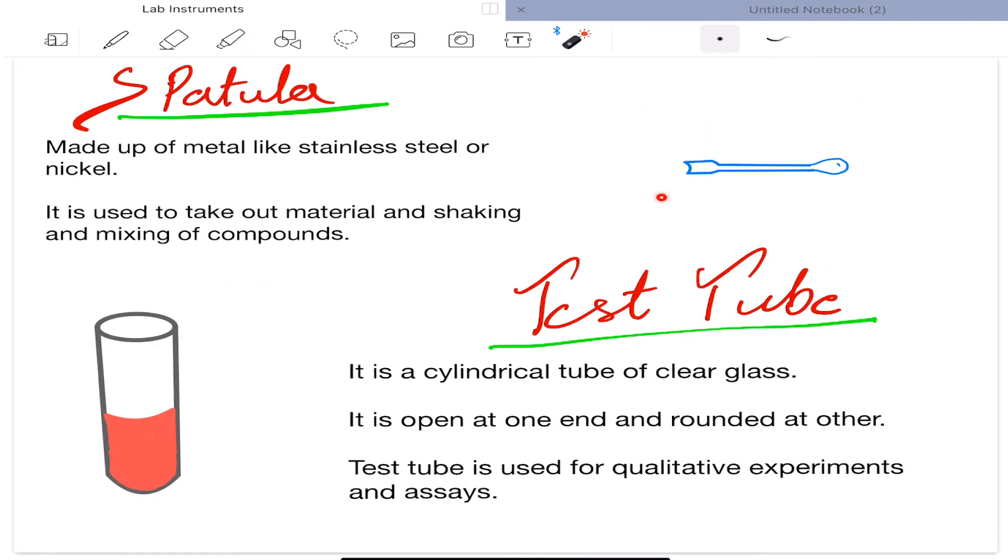Next is spatula. Spatula is made up of metal like stainless steel or nickel. It is used to take out materials, shaking and mixing of different compounds. Next is test tube. It is a cylindrical tube of clear glass. It is open at one end and rounded at the other. Test tube is used for qualitative experiments and assays.